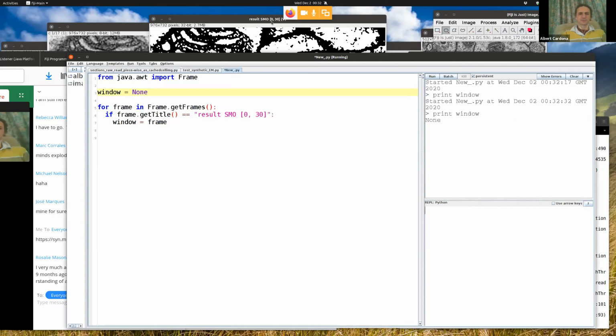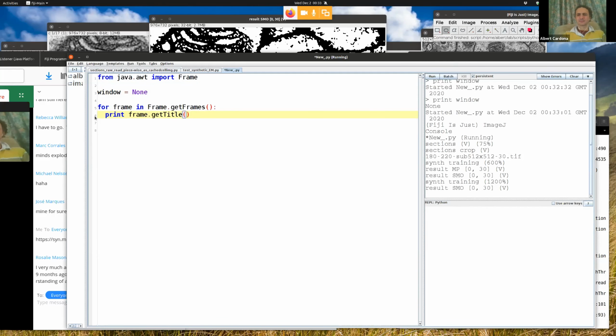Okay, that is now confusing me. How is this not the title? All right. I think I'm just too tired. Is it name? Is it what? Is it not get title? Yes, it's get title.